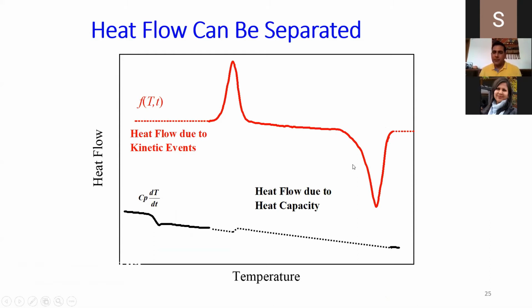Is that fine? Are you people aware of the Origin software? Any participant? Is any participant aware of Origin software? Yes, sir, they are saying yes. Dr. Gurpinder and Dr. JC both are saying yes. So in that case, you can find the area under the curve. Practically, that is the total heat absorbed by the sample. So that can be calculated by the Origin software.